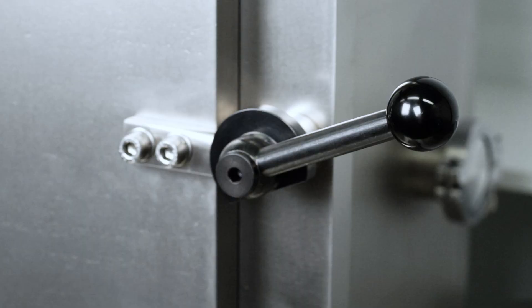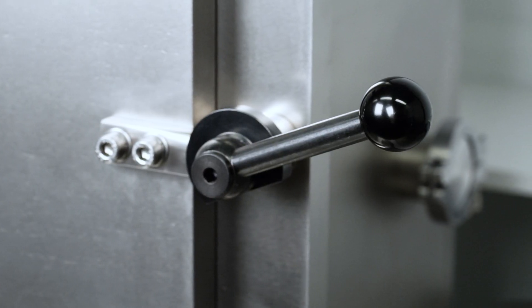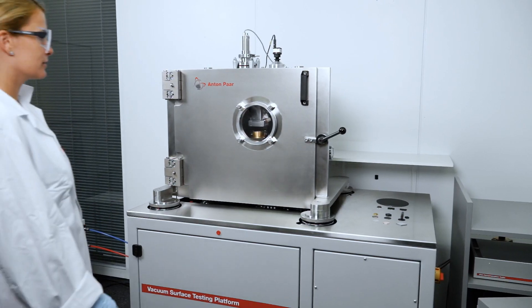A buffer system allows you to switch off the primary pump during measurement so that pump vibration does not occur.